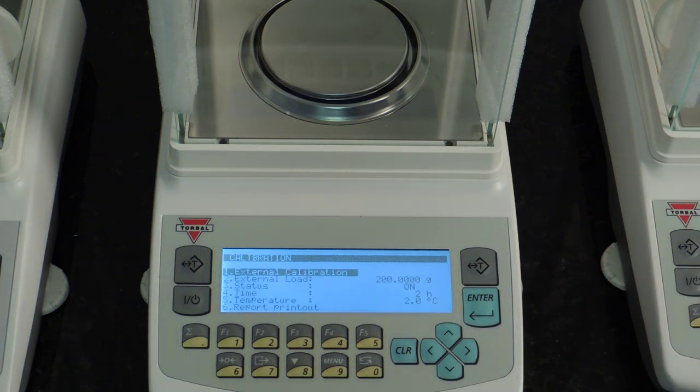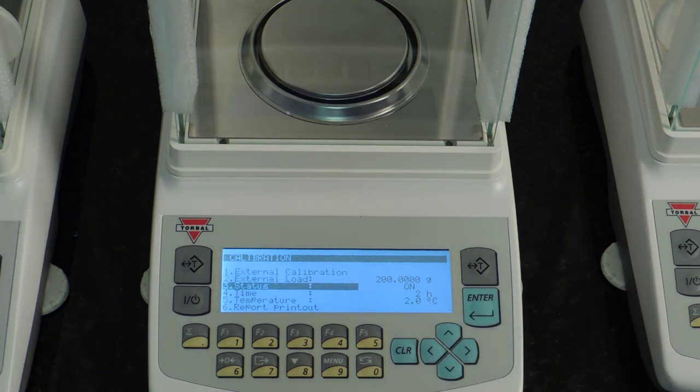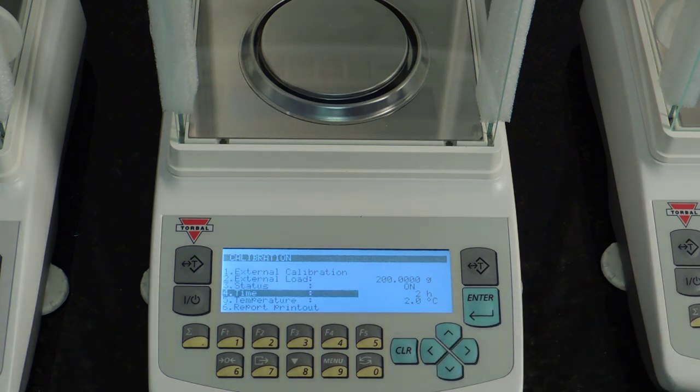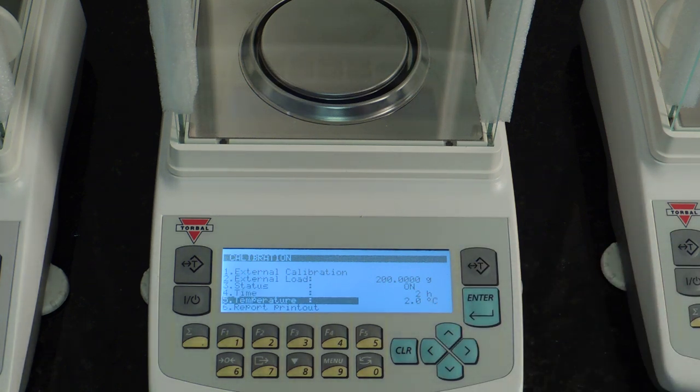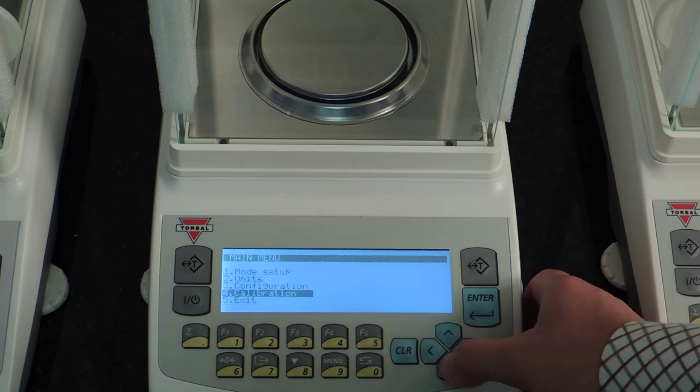Calibration, again, you can calibrate the scale with an external weight. You can configure all the parameters of the internal calibration. By default, the scale will calibrate every two hours with change of temperature at two degrees Celsius. Those features can be disabled should you like to reduce the frequency of calibration for some reason.